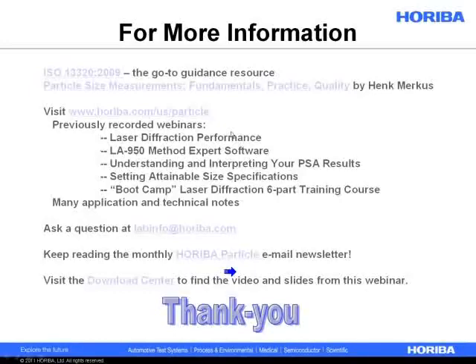Ryan's asking a really good question. When he uses ultrasonics, sometimes the transmittance, which remember is the amount of light that's passing through the measurement zone unscattered, unabsorbed, basically unblocked, drops out of the green zone, and the green zone is the recommended concentration range. What kind of effect, if any, does this have on the final measurements?